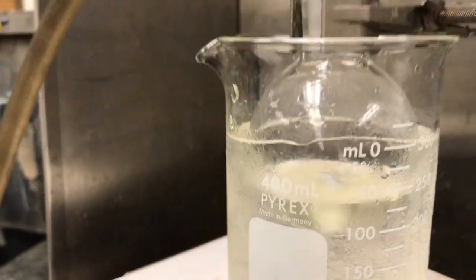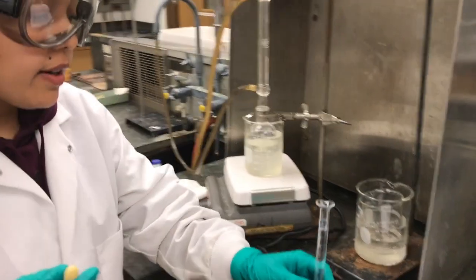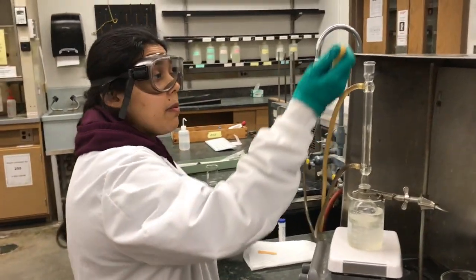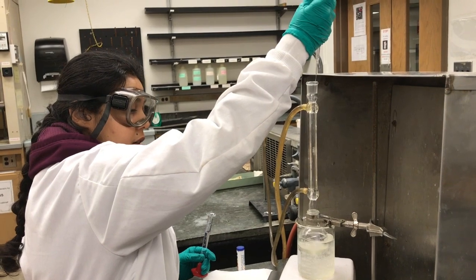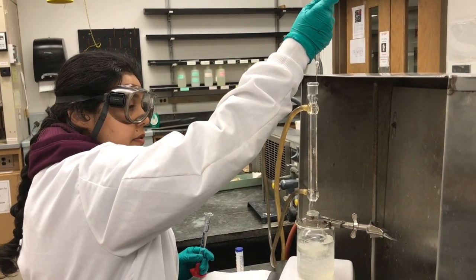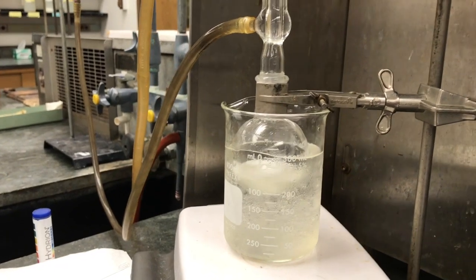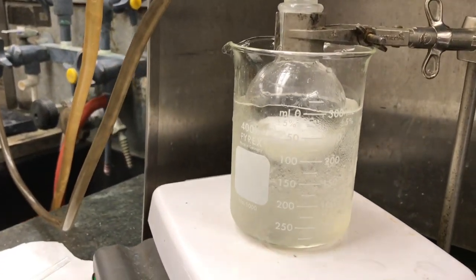Now we're going to add our 2.5 molar HCl. Here I have 10 mL of 2.5 molar HCl, and I'm going to add 1 mL at a time from the top of the condenser. It's supposed to generate a lot of foam and froth. I can see it's generating the foam where the acid is hitting the solution. I hope you guys can see it too.